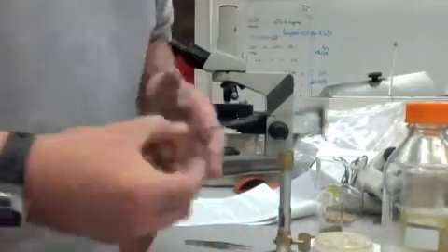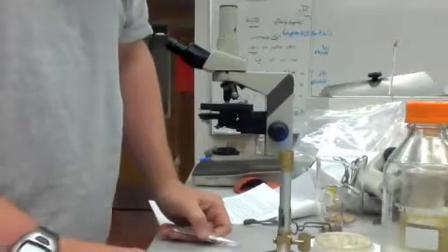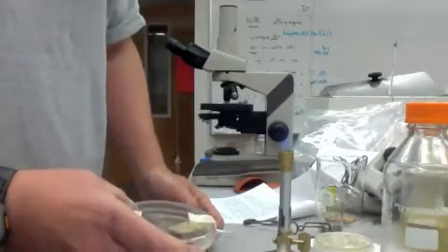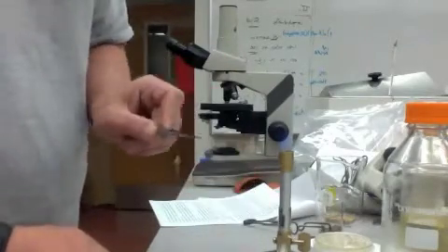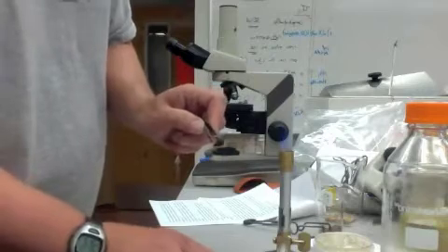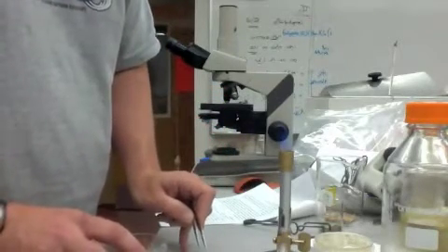I now want to place 3 or 4 of these little dung pellets into this and let them solidify. So what I would do is take some forceps, probably dunk them in some ethanol, flame this. I come in and I pick up my little dung pellet and I just literally drop it into the agar.